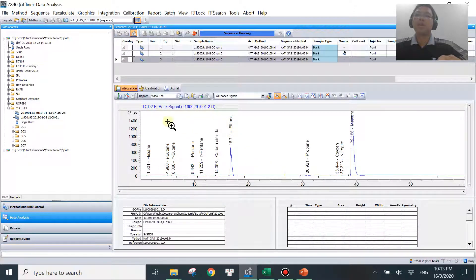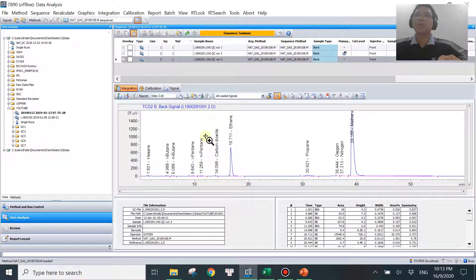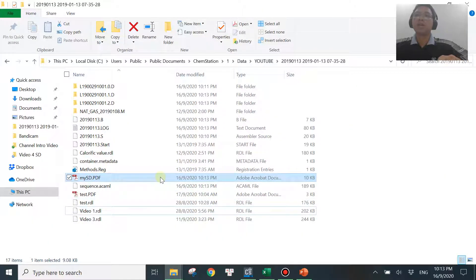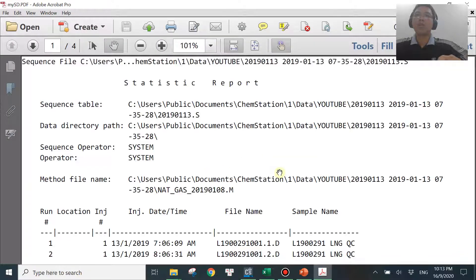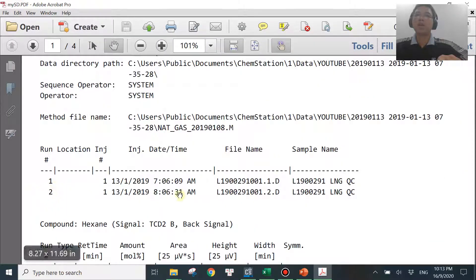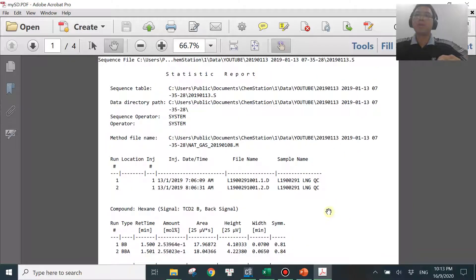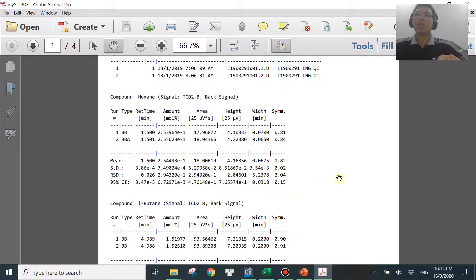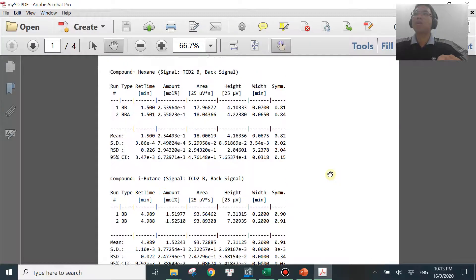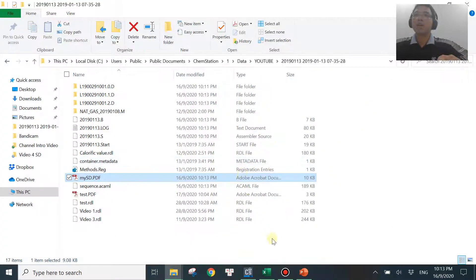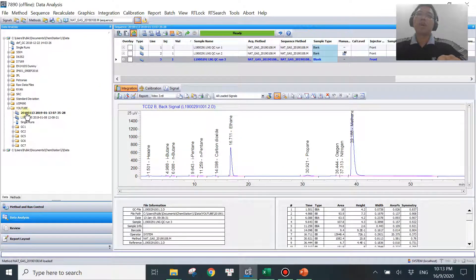Wait for all the processing and sequence summary to complete. Then go back to the folder. You'll see the 'my SD' PDF has been updated — the timestamp will be newer. Open it and now you should have only two runs, reflecting the two runs you selected. That's a very clean way to generate this report.